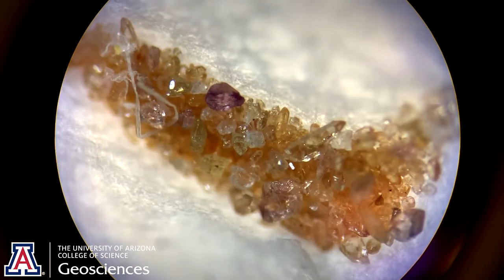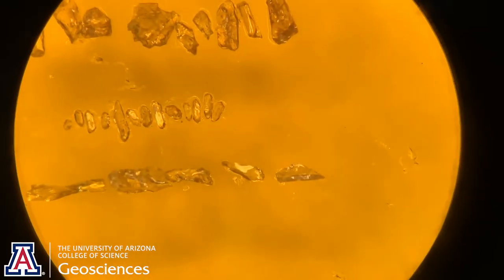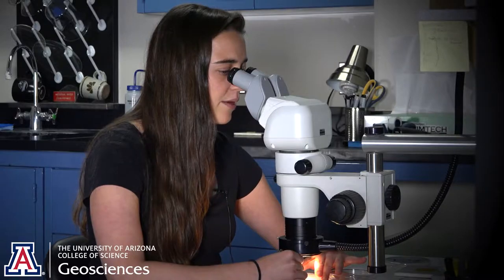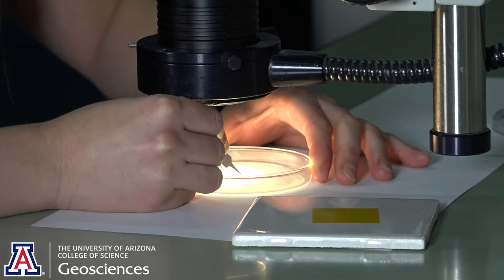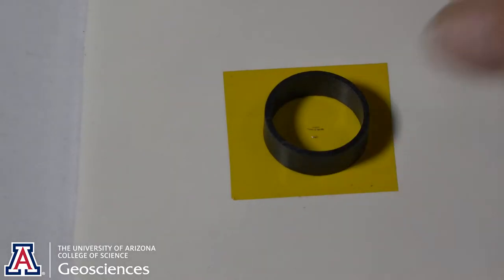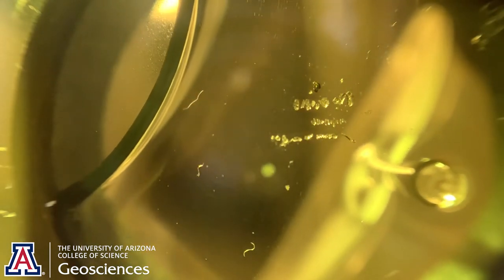They can go directly upstairs to the picking room. Hi, I'm Sarah George. I'm a postdoc in the Arizona LaserChron lab. Broadly, I'm interested in using different trace and rare earth element chemistries along with the ages we produce to look at long-term melt and crustal building processes. Right now I'm picking grains from the rhyolite and I'm going to mount some standards alongside them. We use those standards to bracket and correct the ages we get off the mass spectrometer. I'm sticking these grains onto tape, and after adding all my standards we'll put a ring form around them, pour some epoxy in, sand down about halfway into each grain, and then send them off to the imaging lab to get high-resolution images.